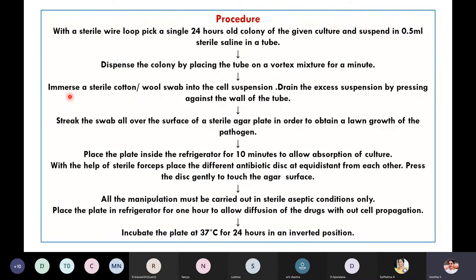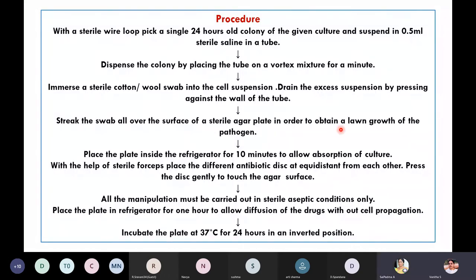Once the media has solidified, immerse a sterile cotton swab into the cell suspension we prepared earlier — by taking the colony, inoculating it into saline, and vortexing. Drain the excess suspension by pressing the swab against the wall of the tube. Then streak the cotton swab all over the surface of the sterile agar plate to obtain a lawn growth of the pathogen.